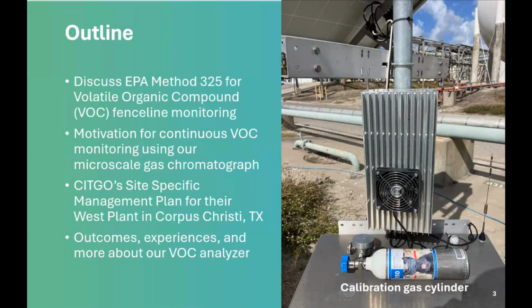For today's presentation, I'll start by sharing a brief overview of EPA Method 325 for folks who might not be familiar with VOC fenceline monitoring. Then I'll discuss the motivation for needing continuous VOC monitoring using our micro gas chromatograph. Then I'll get into the details related to CITGO's site-specific management plan and how they utilized real-time monitoring equipment to comply with Method 325. And finally, I'll share some outcomes from this SSMP case study, some comments from CITGO's environmental management team, and a bit more about our VOC analyzer at the end.